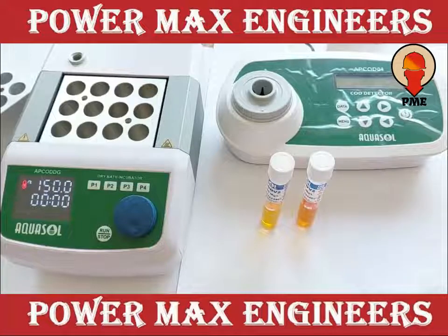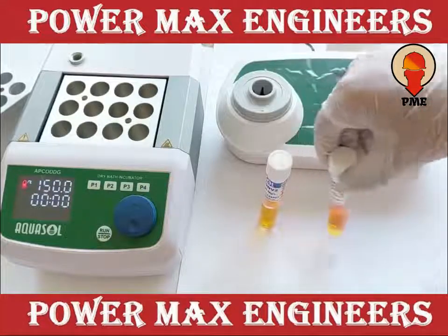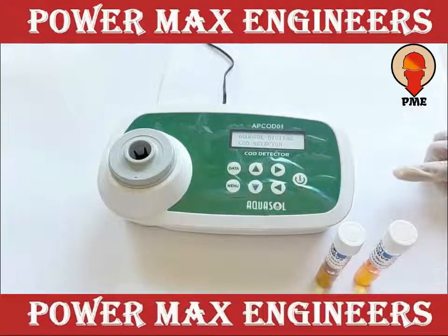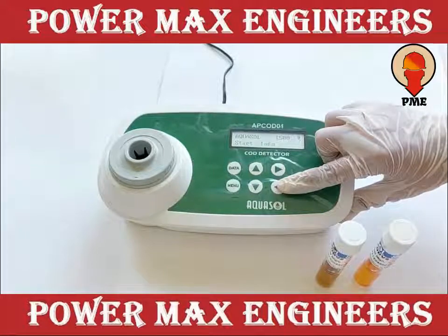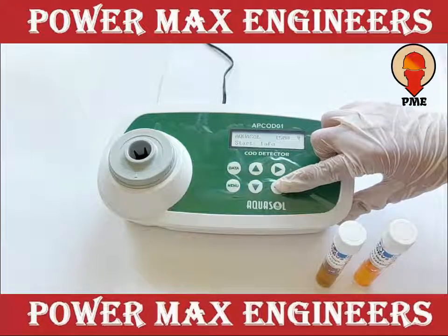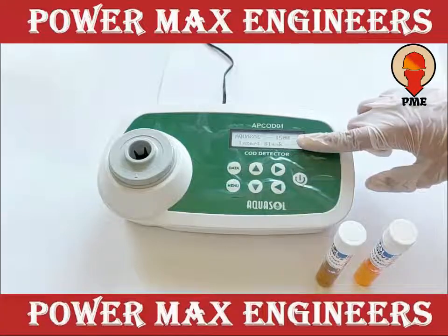Read the COD value in the COD meter. Click on the COD meter and press this key to select the range, then confirm by using this key. Display shows start. Then press the enter key. Now the display shows insert blank.